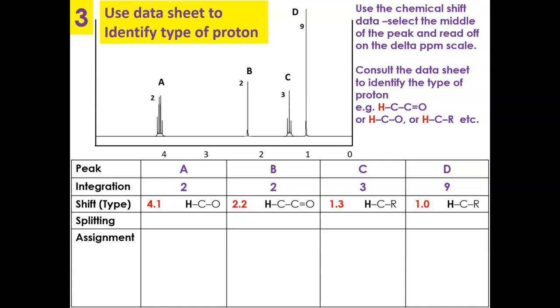Now peak C and peak D both occur in the same band or zone on your data sheet. These two are rather common, of course. These are hydrogens bonding to carbon, bonding to more hydrocarbon. So you'd expect to find these on any or most organic compounds. But there are 2 peaks in the same environment, and of course they're not the same thing.